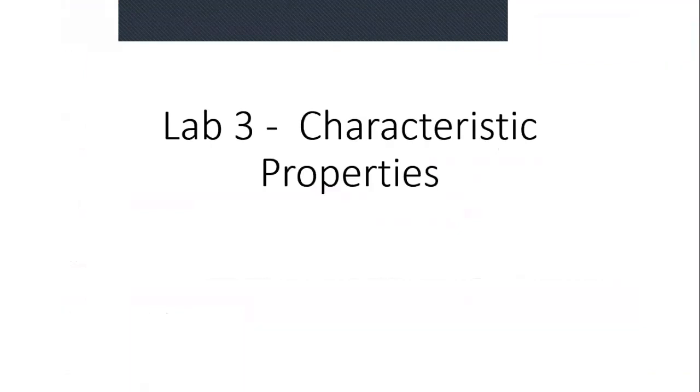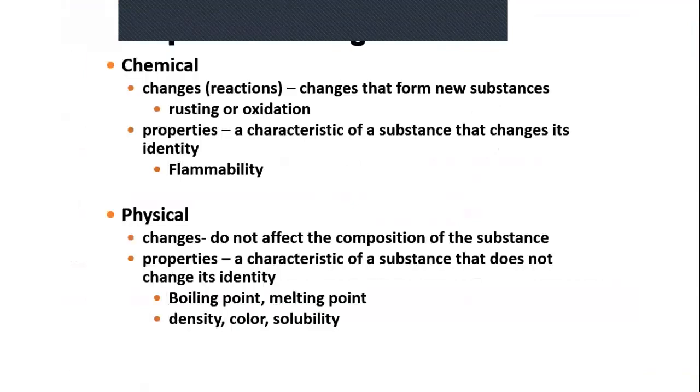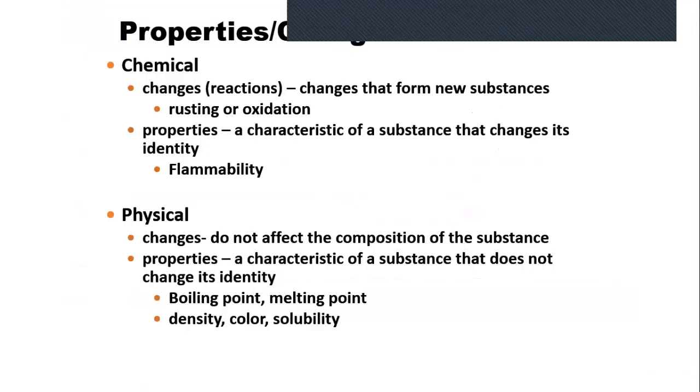For Lab 3, we'll be looking at the characteristic physical properties of different substances to determine an unknown substance. And so again, just like in the last lab, we'll be looking at both physical and chemical properties and changes.